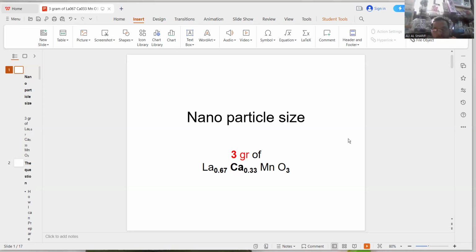One of them is pure water, like I said before. The other is hydrochloric acid. After that, precursors, and I will explain why I must calculate them. Last thing, and the most important thing, is the agents, and I explained why we use it.